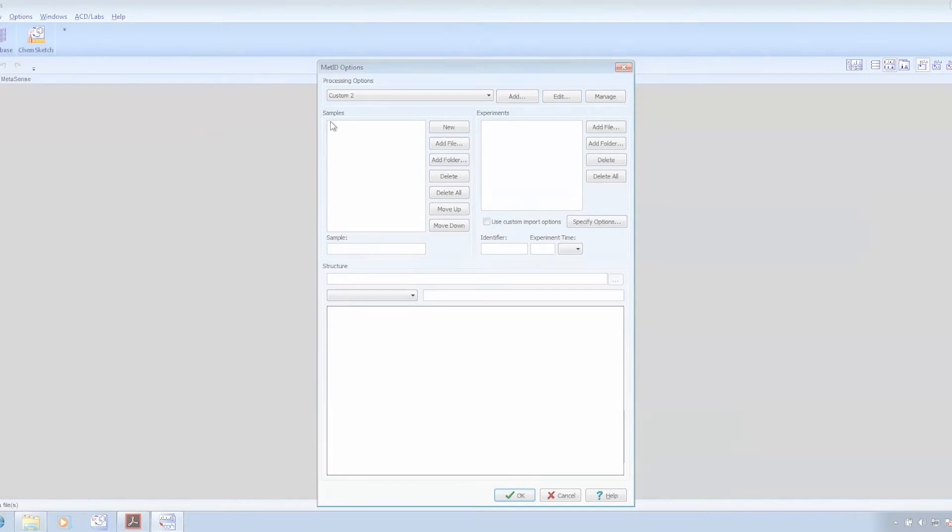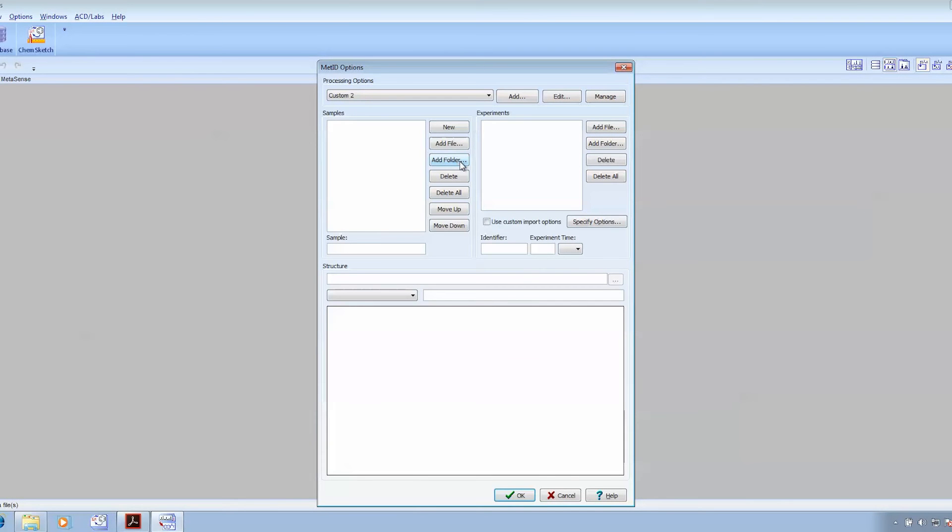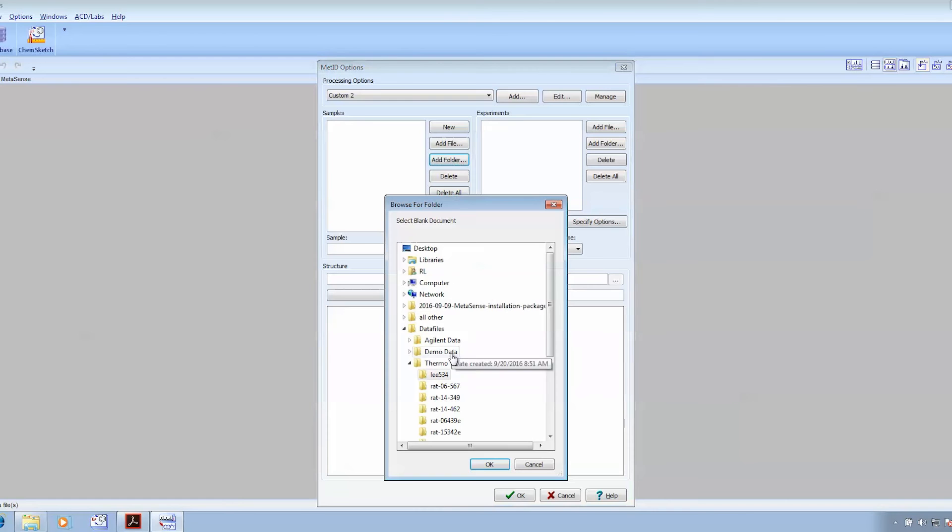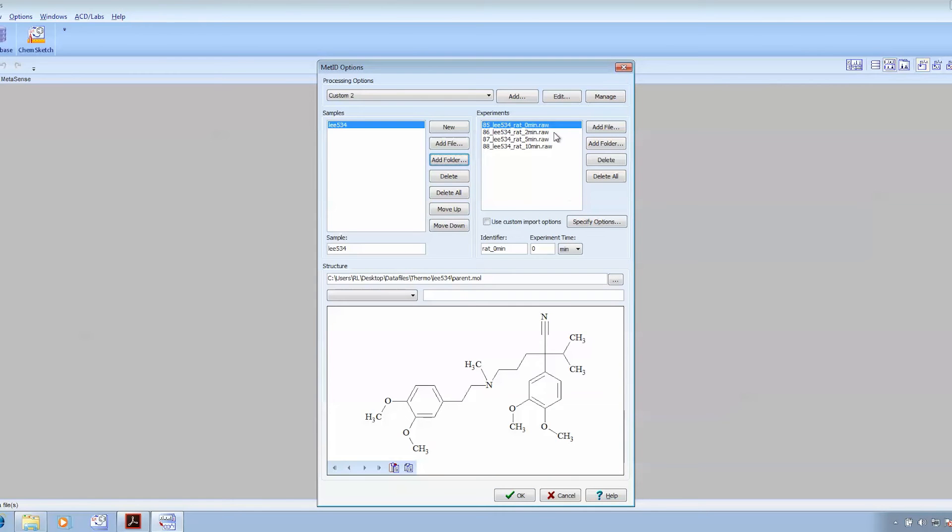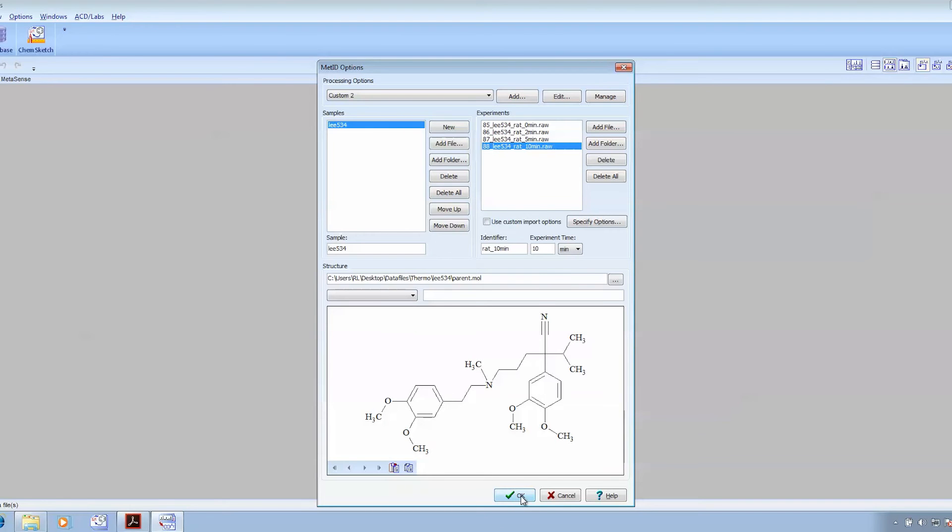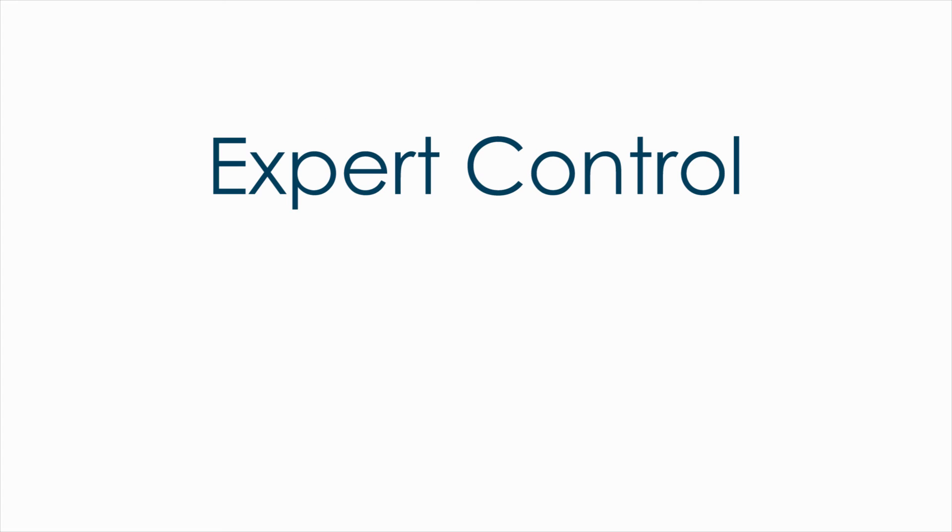Well, we load the data through our processing interface where we can simply load in a set of data that represents an incubation study, as you see here, or individual data files along with a structure file. Once the parameters are set, you can just simply click on OK and let the processing routine work.